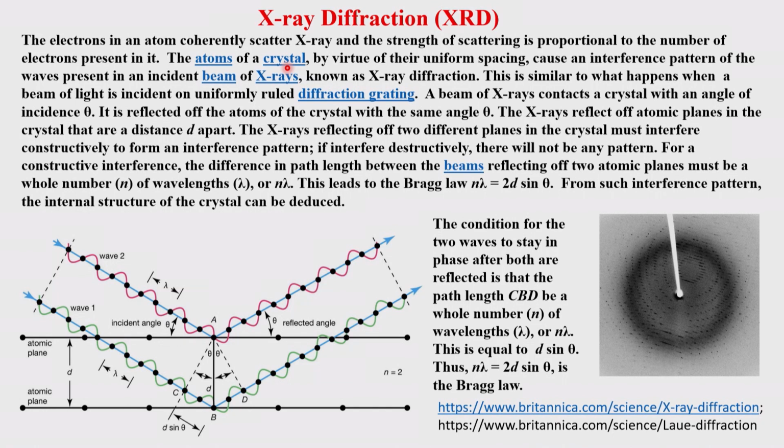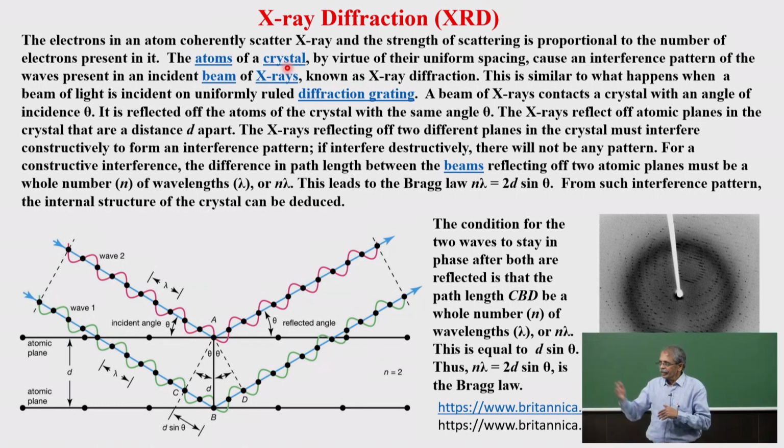The lattice versus the presence and absence of the X-ray diffraction spots has a great relation, and this relation, which we will not go into in detail, is called the reciprocal relation. If you look at the planes and atoms in your crystal versus the spots which are found in the X-ray diffracted film, there is an inverse relation, called the reciprocal lattice relation.